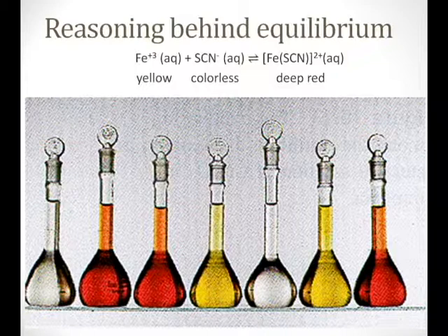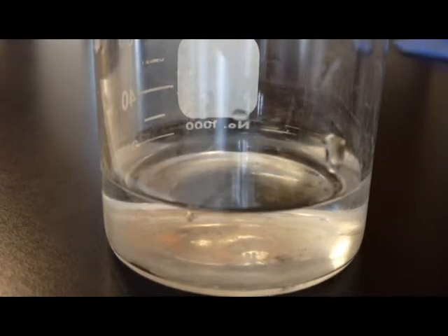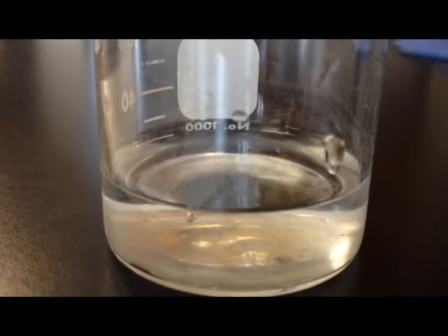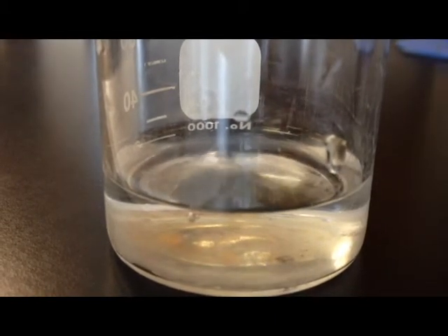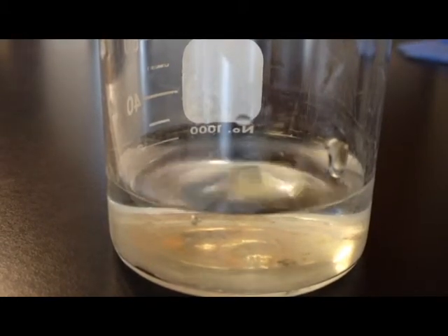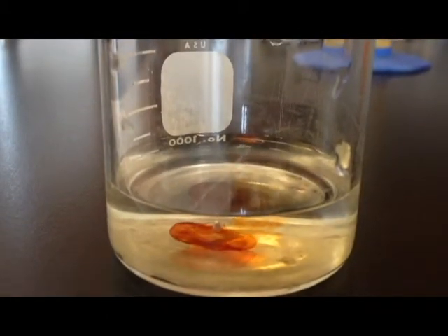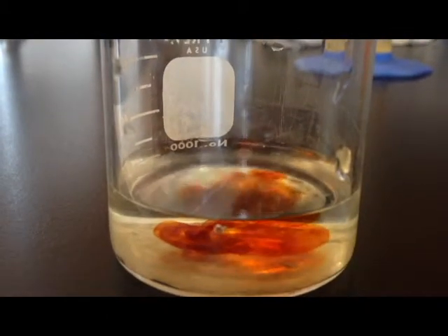In order to form the complex ion, we start with 20 milliliters of distilled water and add 20 drops of 0.1 molar iron nitrate along with 20 drops of 0.1 molar potassium thiocyanate. The iron and the thiocyanate react to form the complex iron thiocyanate ion, which is bright red-orange in color.